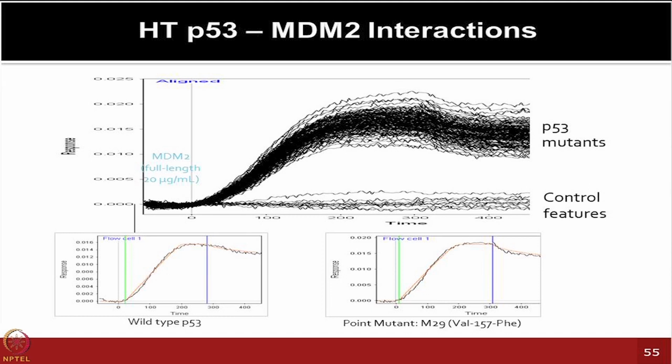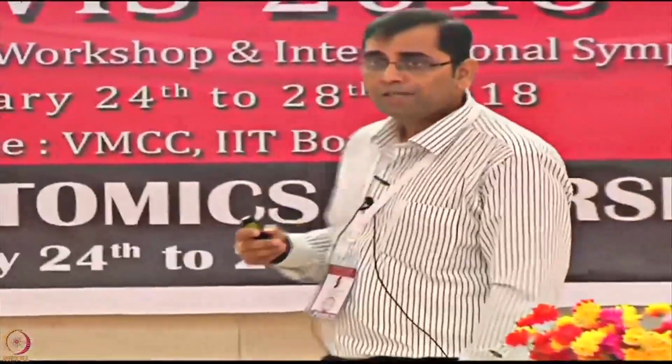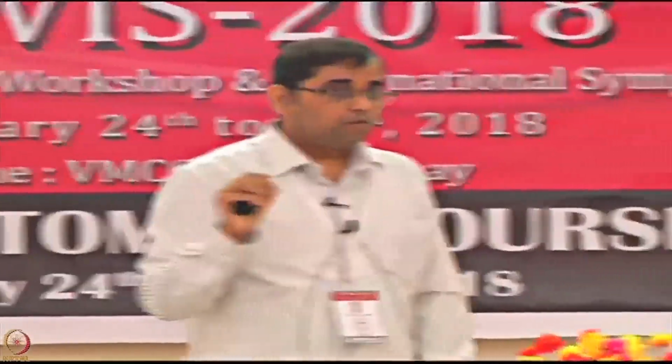Especially, we were also finding that there was probably some sort of bulk effect we could observe even in the control spot. There is some sort of binding which could be observed. So for the next steps of this technology development, we were seeing that even for NAPA chemistry, the HaloTag chemistry which you are seeing now is showing a much more robust signal. So could we now try out the same thing on an SPR platform using the revised NAPA chemistry?